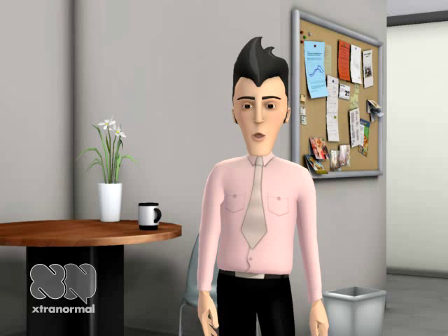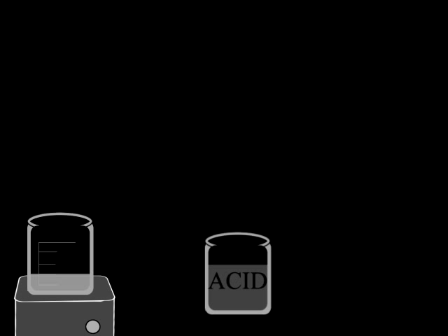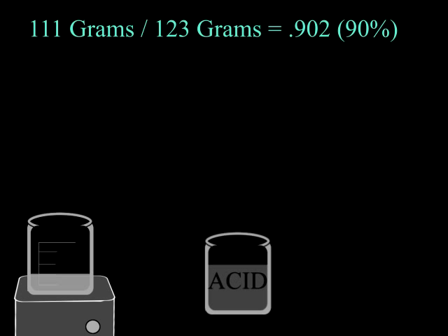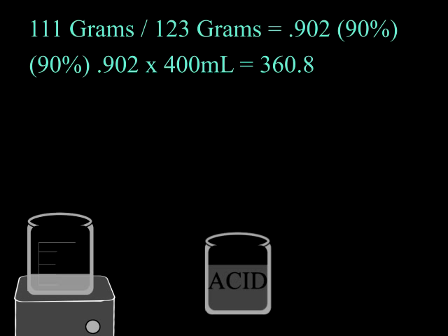We take our sample of copper carbonate and place it in the other 500 milliliter beaker, and we slowly add a stoichiometric amount of the acid depending on your yield of copper carbonate. You can figure this by finding out your percent yield. Our theoretical yield was 123 grams, so if you have less than that, divide what you got by 123 and that will give you your percent. Take that percent and multiply against our 400 milliliters of acid, and that will give you your stoichiometric amount.